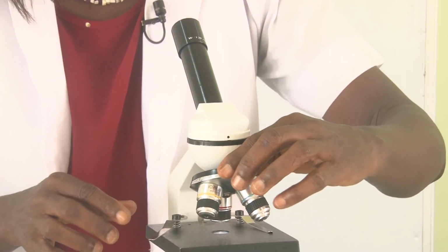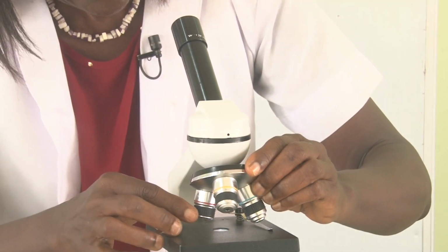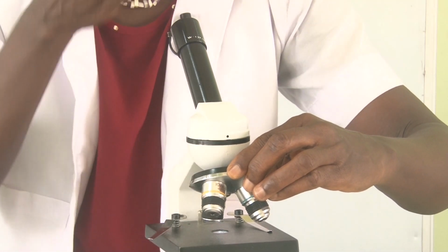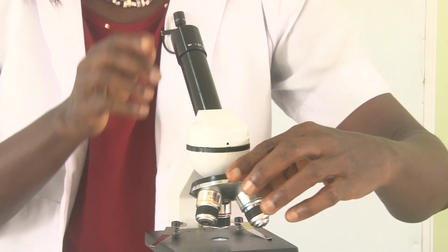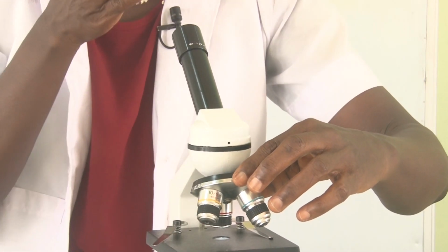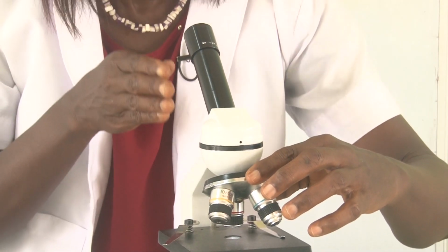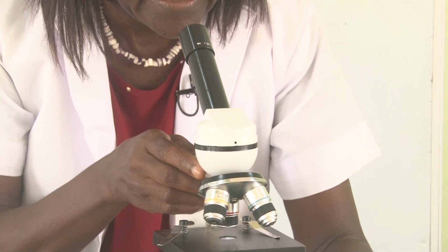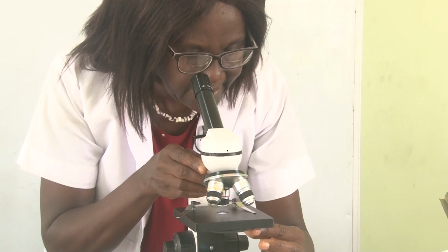You move the revolving nose piece, and when it's in line, you hear a click. So the objective lens and the eyepiece lens are in line, so there will be light in it. If you can't see light, you need to regulate the diaphragm and the condenser, so you have plenty of light.